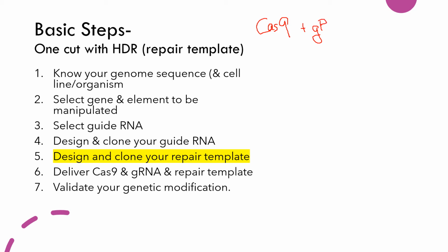So that means we need to make a repair template. So now with a repair template, it allows us to control the repair.